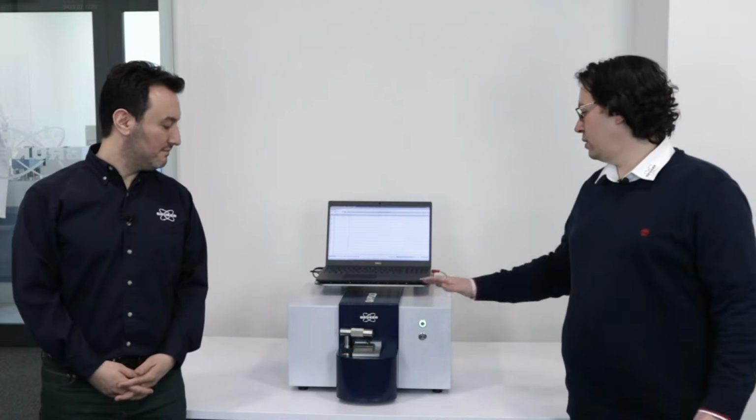Hi, welcome to Application Lab. My name is Thiago Souza. I'm here together with Okan Celik today. We are both application scientists for optical emission spectroscopy here at Bruker. And today we're going to be showing you a little bit what we do here in our lab and about some of our instruments here. To start with, we have a Q4 Polo here. Okan, can you please explain a little bit more about the Q4 Polo?